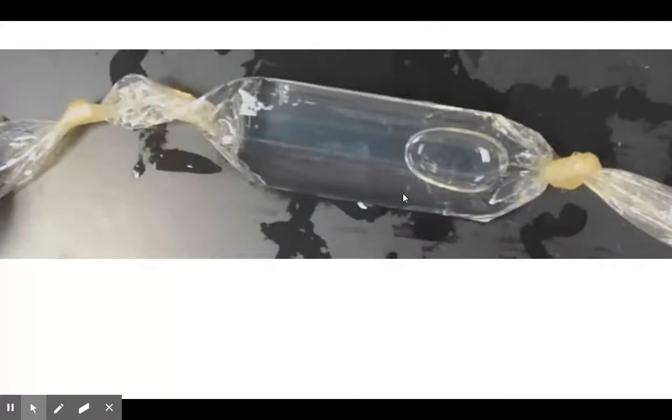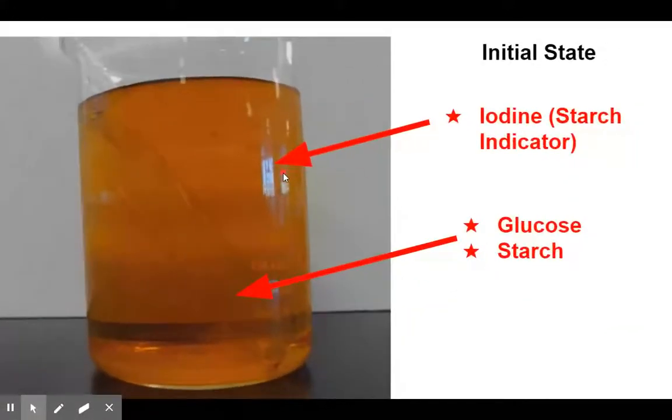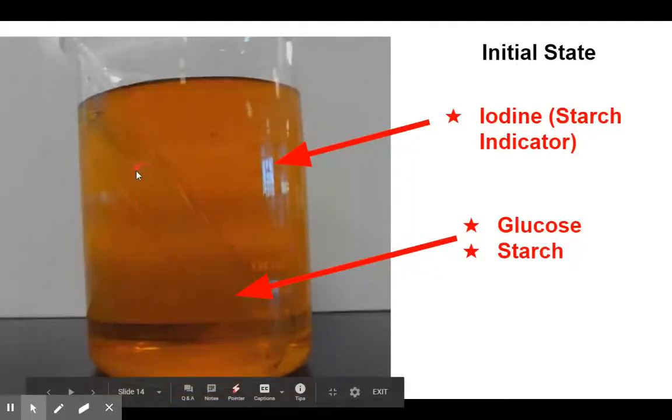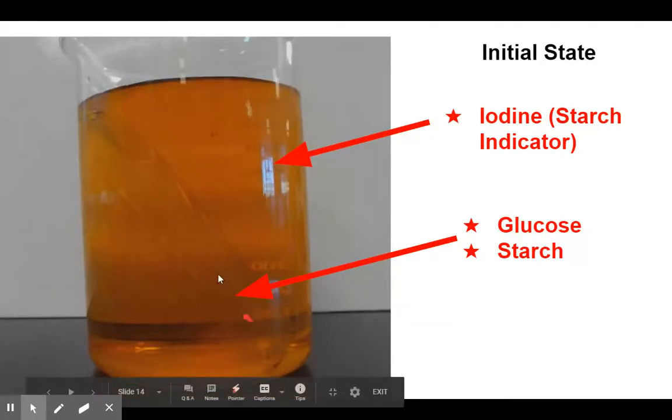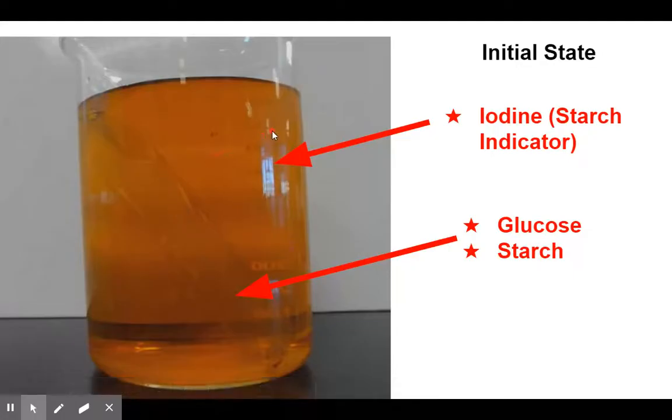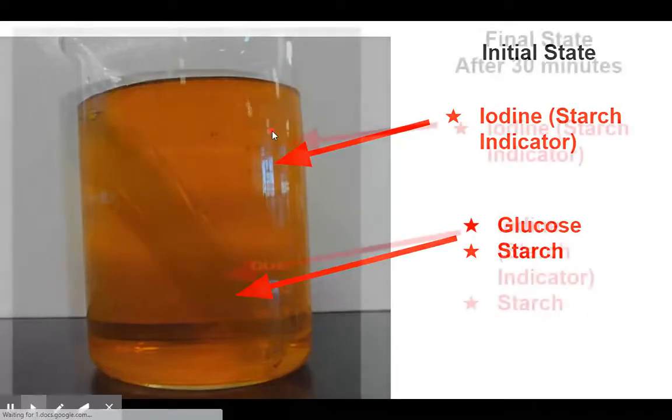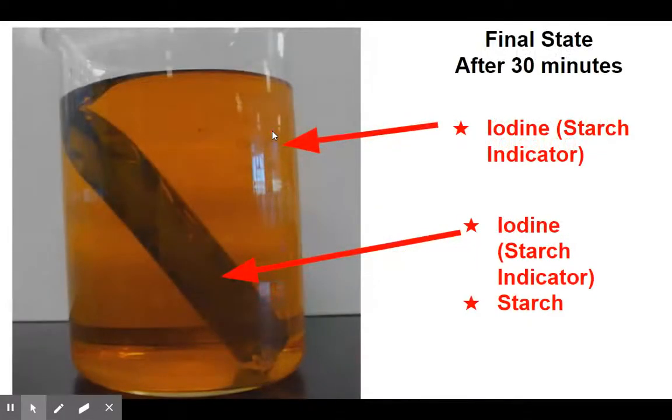This is to set up the experiment. We're going to look at the initial state of putting the dialysis tube, which is right here, in a solution of iodine, which is a starch indicator. Because there's glucose and starch on the inside initially, we're not going to notice anything. But after time goes on, we notice something. What do we notice?